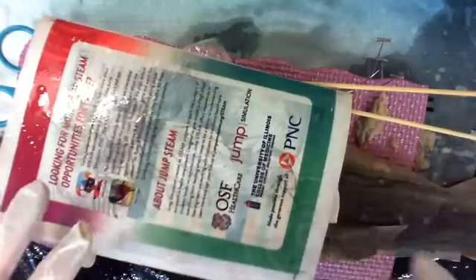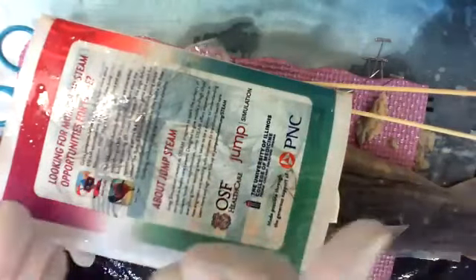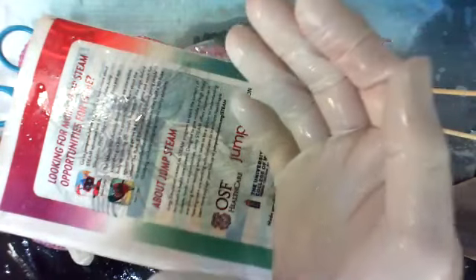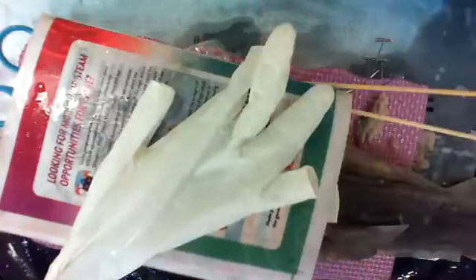Here's where it gets tricky. You got to remember which side had the seam on the black bag. Like my side is over here. So I'm going to take off my glove that's on the side of that. Oh, sorry. I'm going to take off my glove on the side that does not have the seam. When I took the glove off, I grabbed the outside and pinched it, peeled it off. Hands are nice and clean. A little bit of sweat, but no grossness.